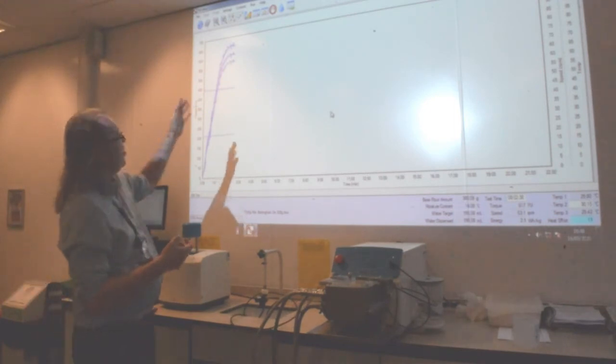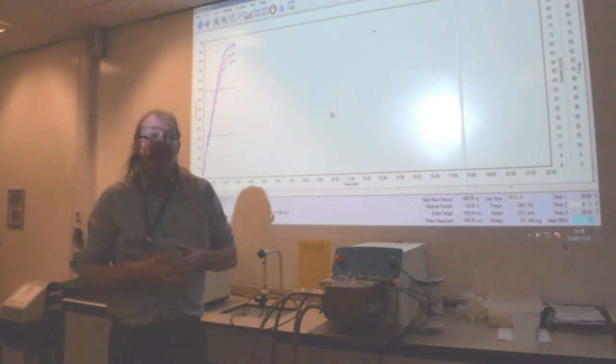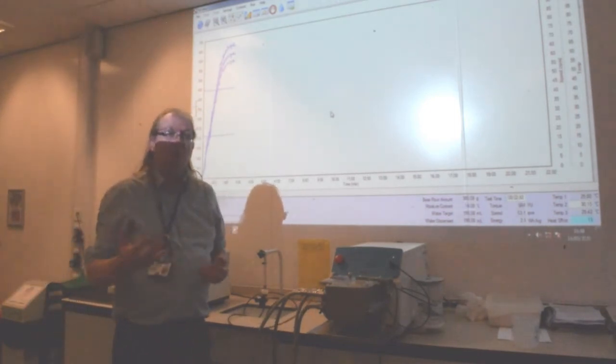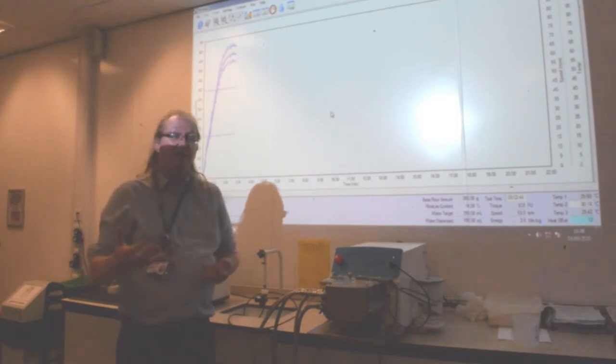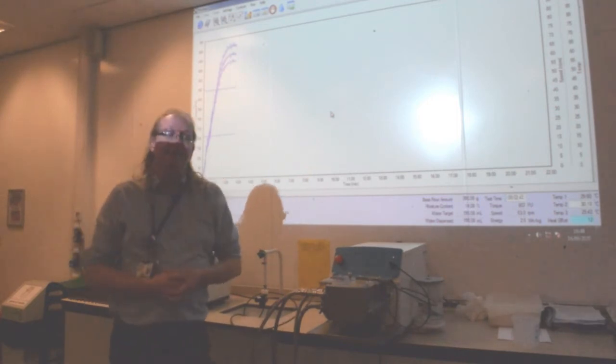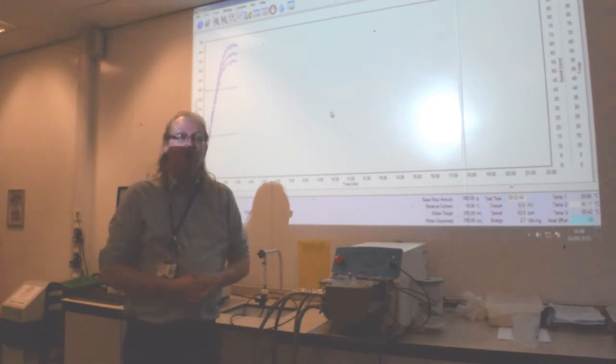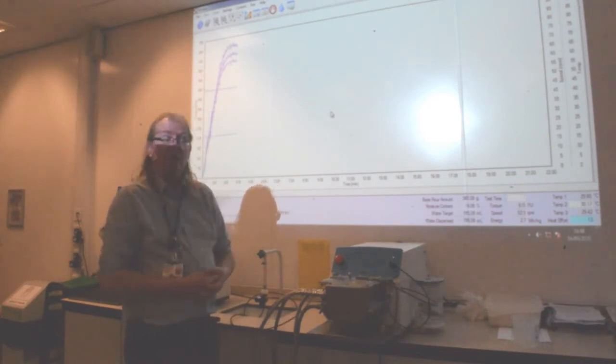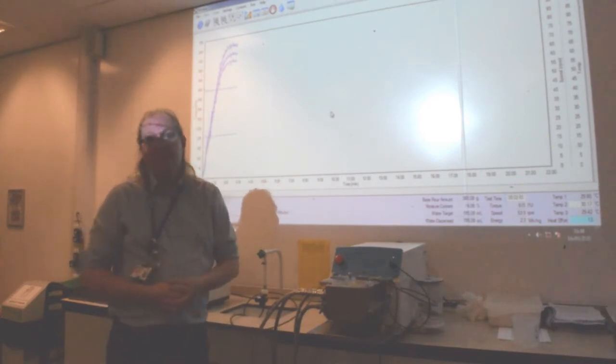We're going to allow this to continue. I'm going to come back to this demonstration just before the 20 minute mark where I can show the result of this particular trace sample.